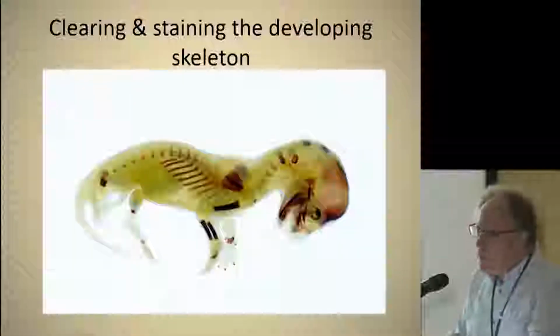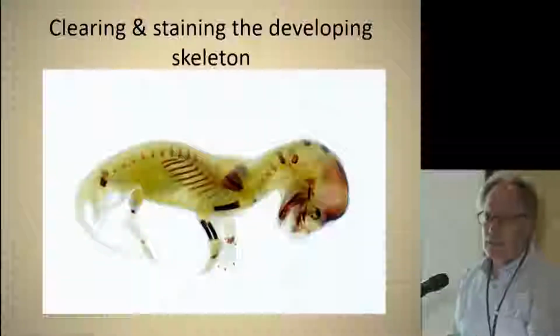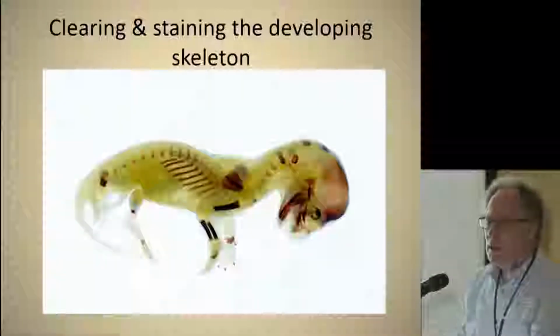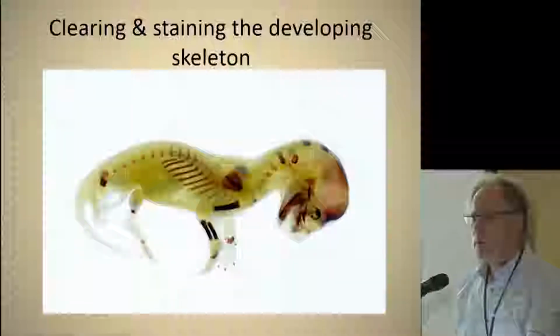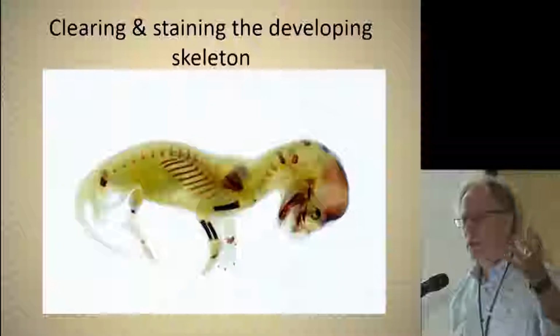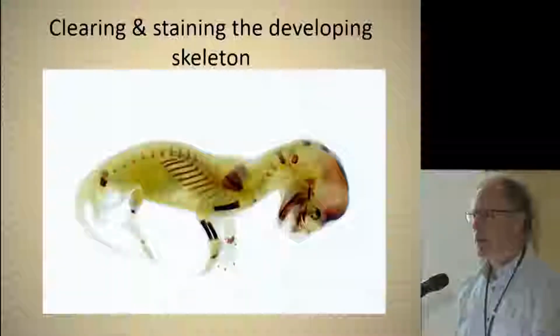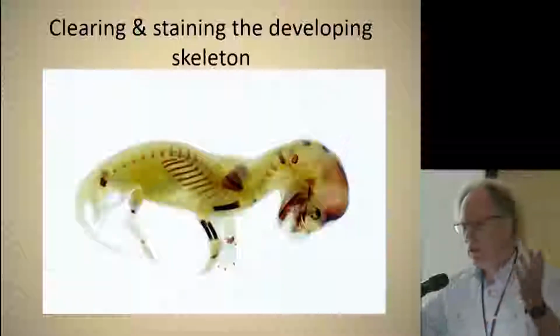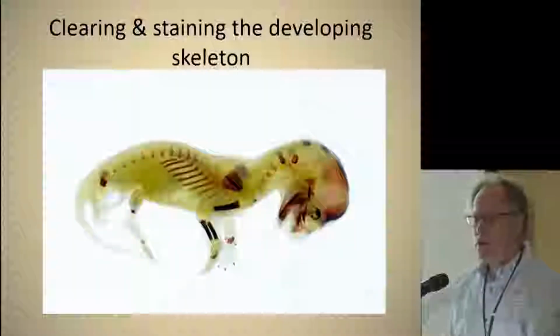But again, just different techniques that you can apply to your microscopy to solve that question, all very doable on a shoestring budget. One of my favorites is, I like osteology very much, and this is a technique that I'm sure you've seen used many a time, but clearing and staining of an embryo is something that I like the students to do. I can hand them a jar that has a clear and stained cat skeleton and explain to them about epiphyses and diaphyses and cartilage becoming eventually bone, but it's not quite the same as having them do that as a project.